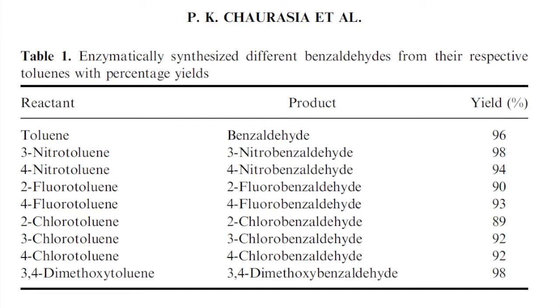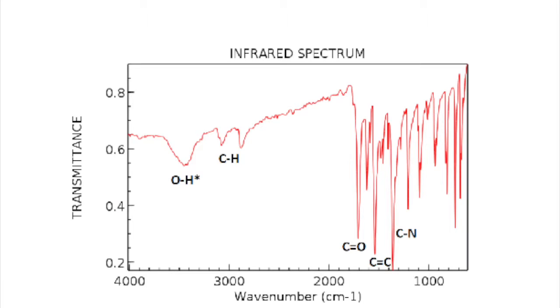For starters, we were given a table of molecules that were synthesized in Dr. Charage's lab and were informed that our molecule was one of these. We immediately focused on the IR spectrum and trying to figure out what the peaks referred to.